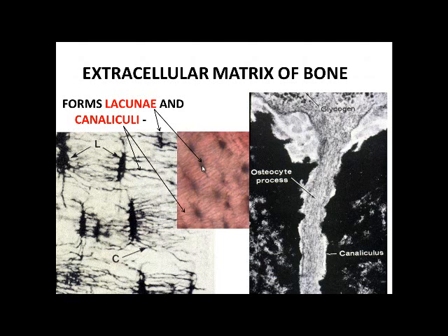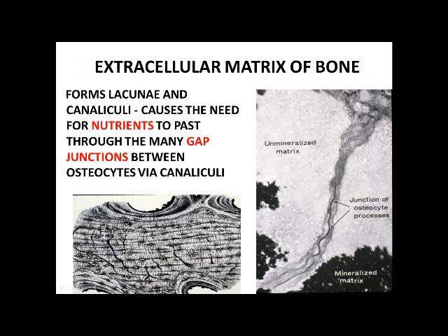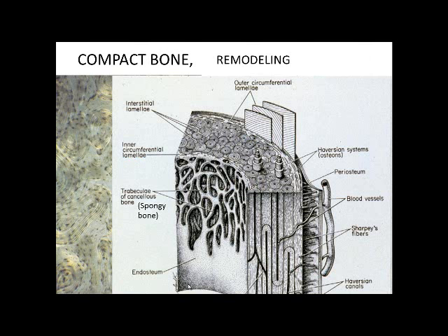In our specimen we'll see lacunae — those openings where the cells would be — and canaliculi, where one cell touches another cell. In those channels, where one cell touches another, you have gap junctions. Gap junctions are the source of nutrients being passed from one cell to another. As a blood vessel is present, nutrients are passed through the canaliculi via gap junctions — that's how cells inside bone get nutrients from the bloodstream.